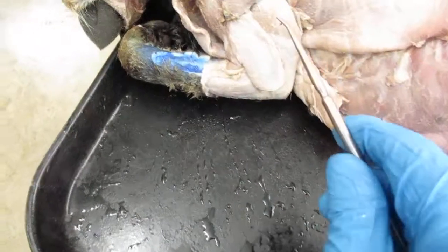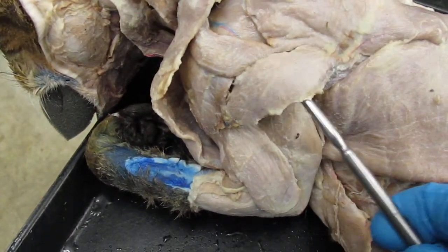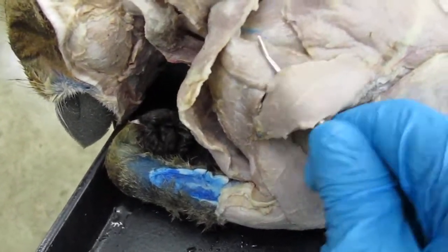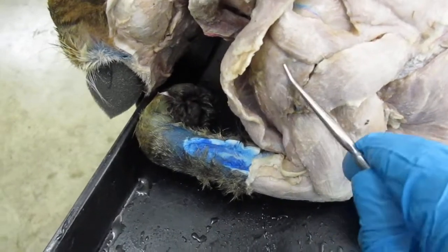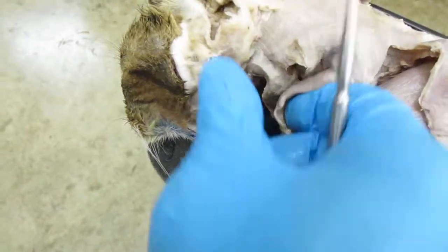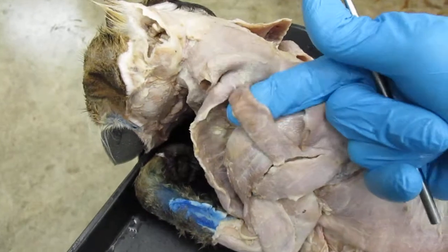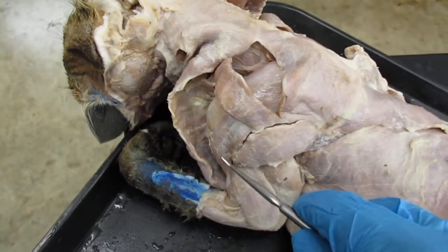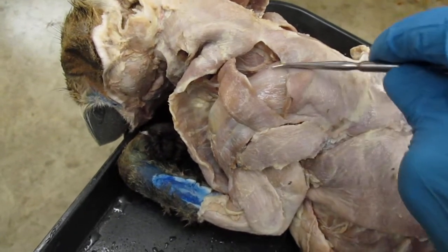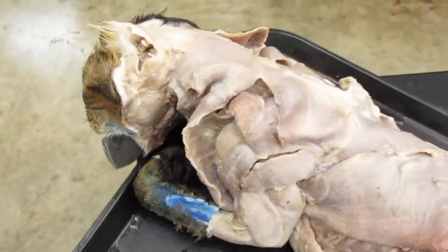I want to show you the deltoid muscles. There's two deltoid muscles. We have the spinal deltoid right here, and then the acromial deltoid is this one right here. This strap-looking muscle here is the levator scapulae ventralis. So, acromial deltoid, spinal deltoid, and levator scapulae ventralis.